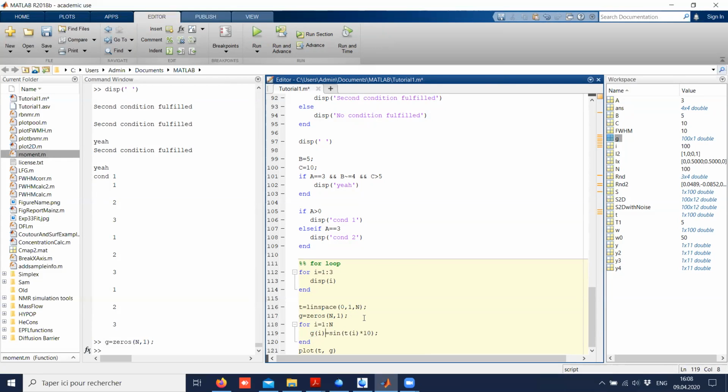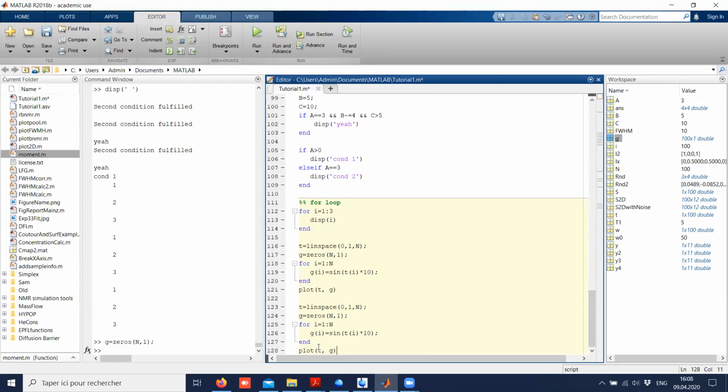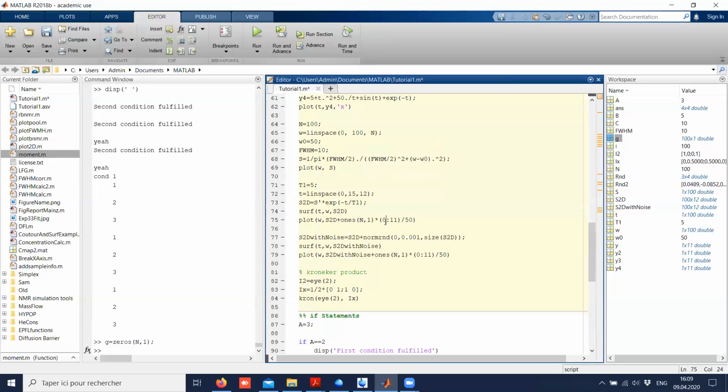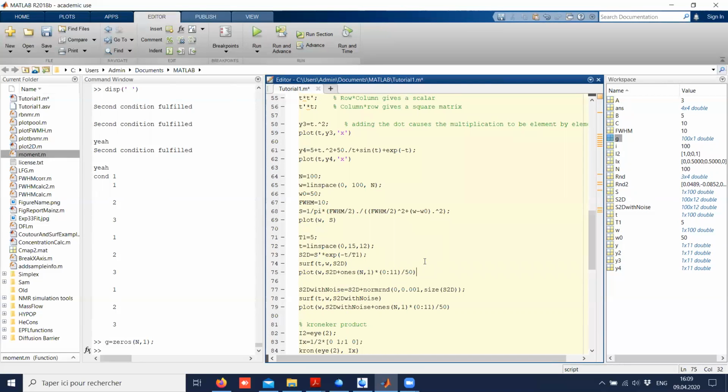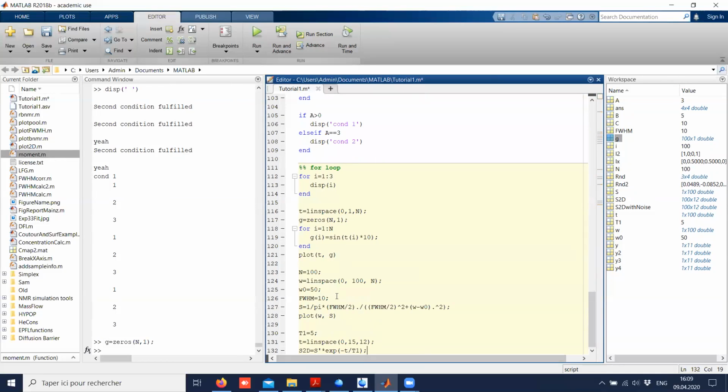The second reason why it's not so clever, I will show you an example here. So I copy this. Now, let's take our example that we had here. I'm copying all this with a large number of points.